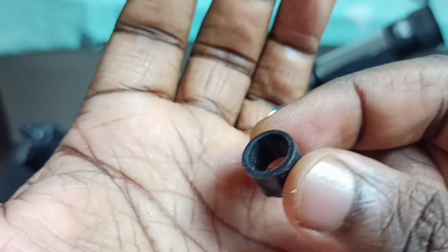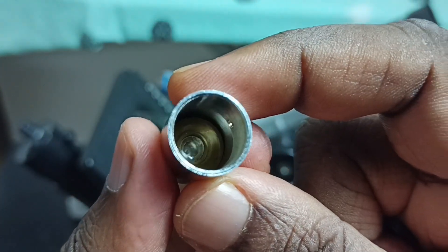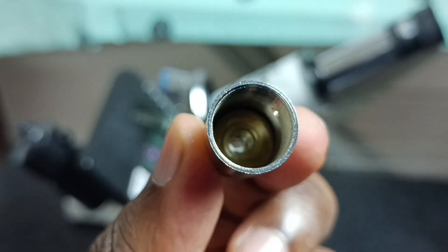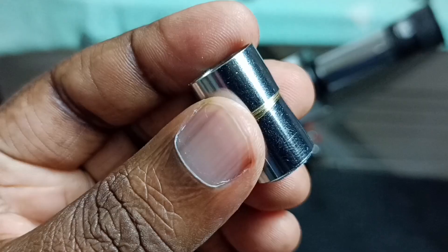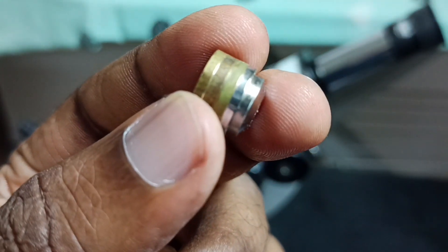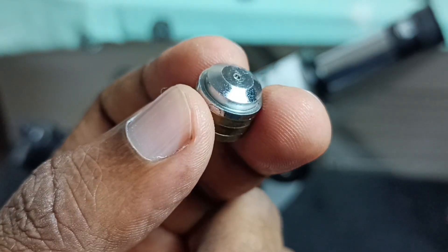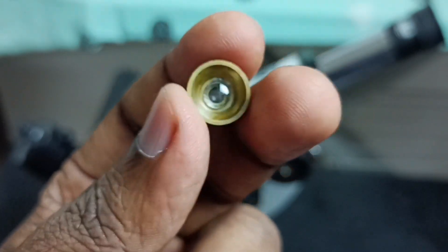There is another plastic, and the lens is still inside. This we can clean.